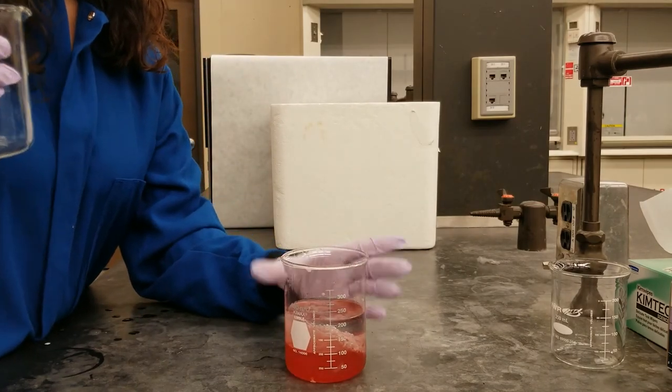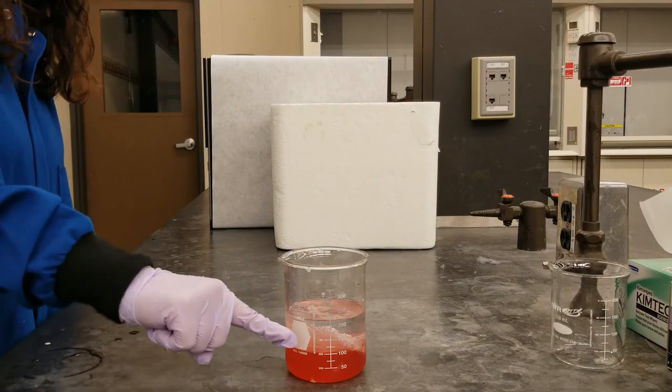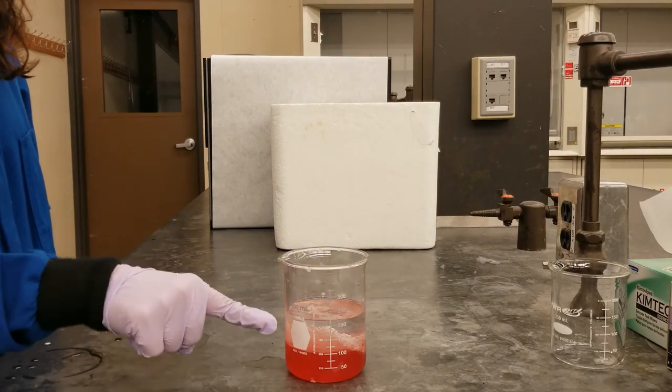We'll let this sit for about 2 minutes, and in the meantime, we'll watch for any precipitation of our DNA, which is the cloudy, somewhat translucent film layer that you see in between.